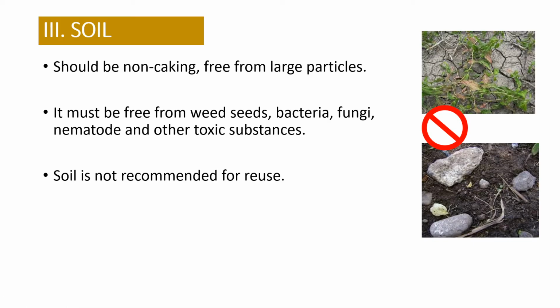And the type of soil that we have to choose for the germination test should be non-caking type. It should not have pebbles or large-sized particles, stones or such. We have to remove them. We have to grade the soil and go for the seed germination test.